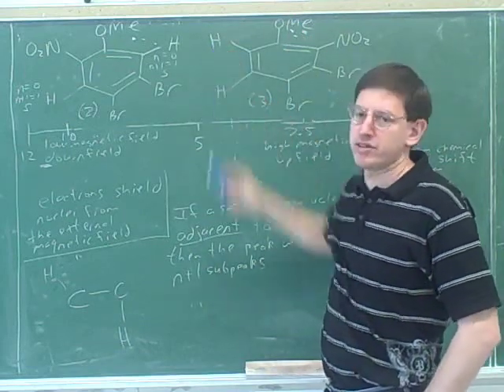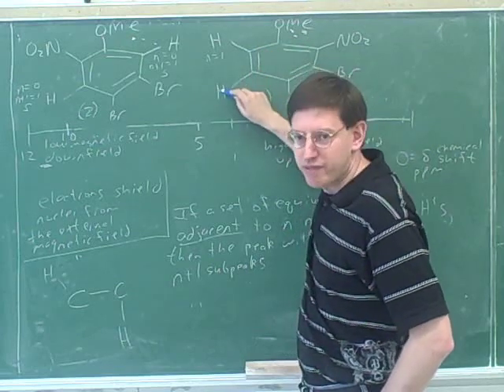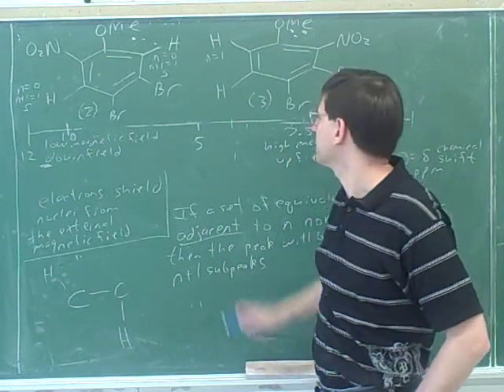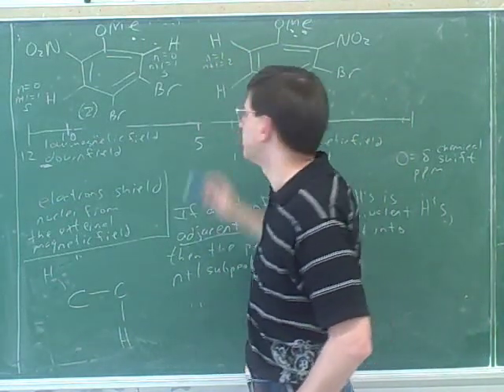Okay, well what would N be then for this hydrogen? 1. Because it's only 1, 2, 3 bonds away from this hydrogen. And we know that we definitely get 3 bonds splitting. So N plus 1 would be 2, and what do we call that splitting? A doublet.